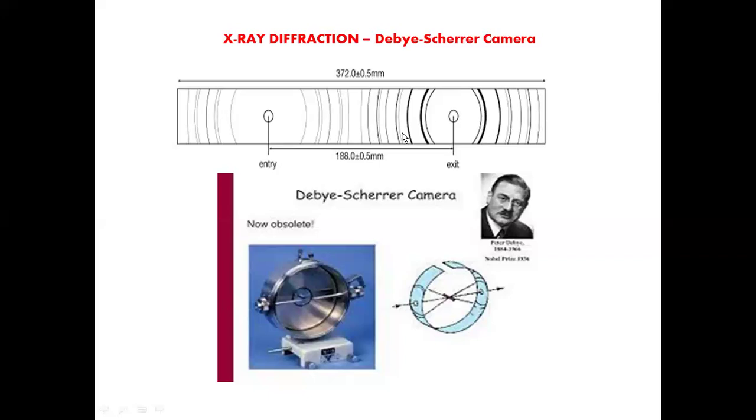This clearly shows that the given sample under investigation is a face-centered cubic crystal, because for the face-centered cubic crystal, the allowed Miller indices are such that doublets and singlets are formed continuously. So by looking at the X-ray diffraction pattern, we can judge what kind of sample it is, whether it is simple cubic, body centered or face centered.